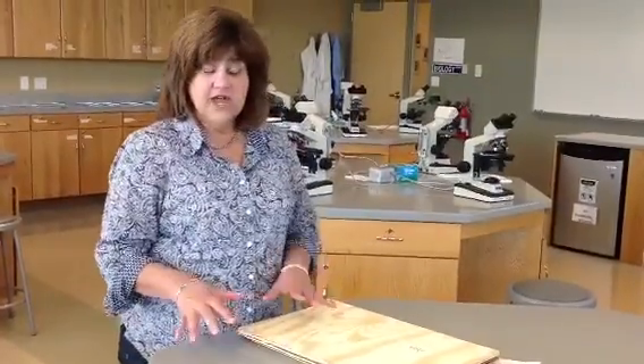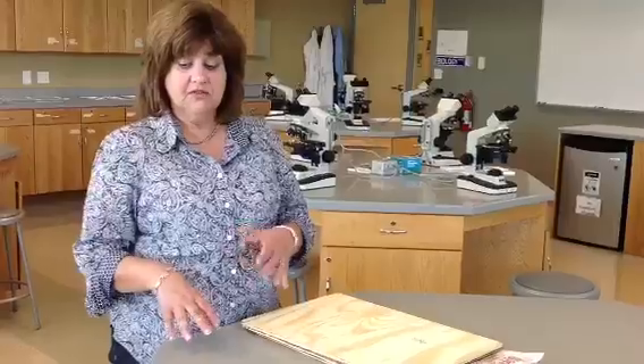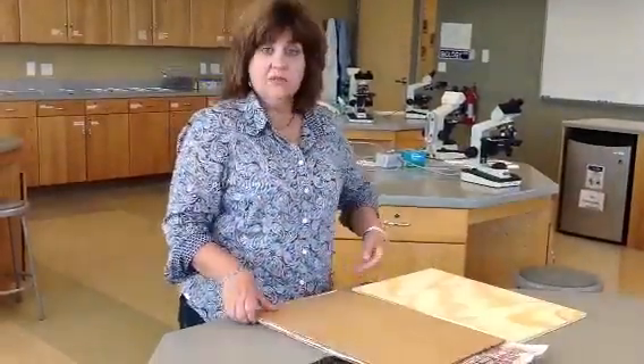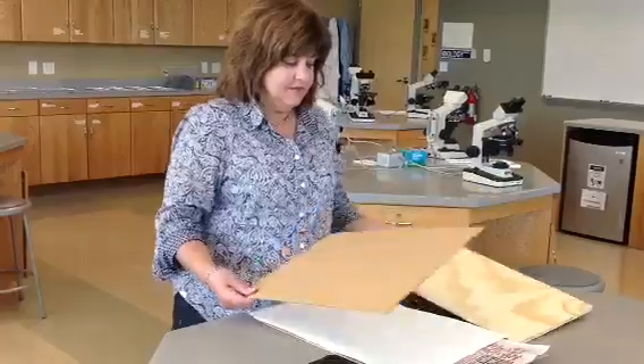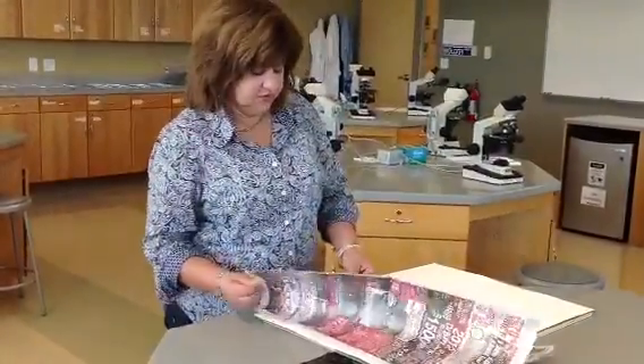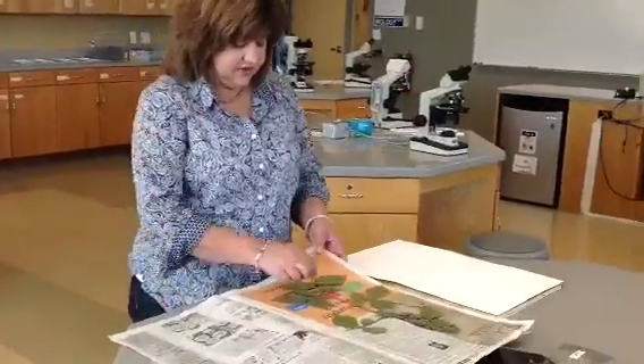Today we're going to begin by learning how to prepare the herbarium specimen by gluing it onto the paper. Last time we stopped with pressing the plants. So now I have a plant press — I'm going to open it up. I have a sample that I opened before and moved it around, and now I have a dry, pressed specimen.